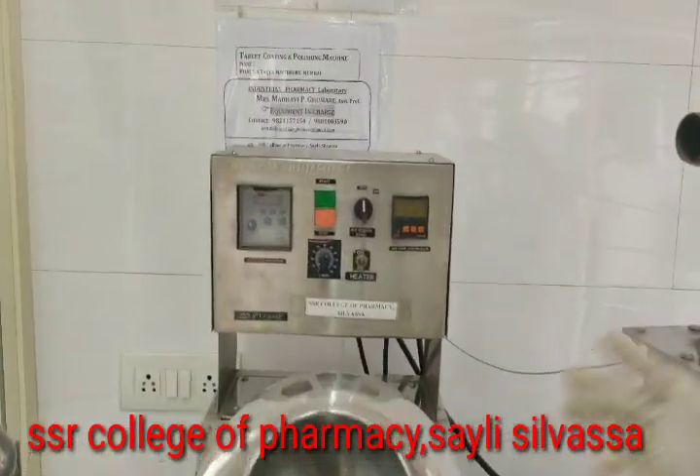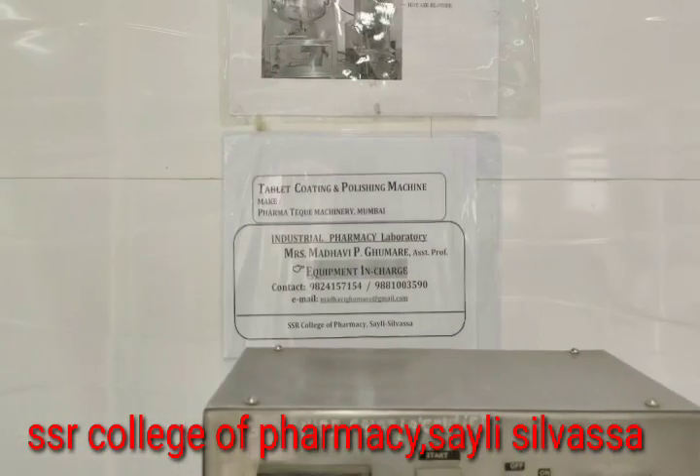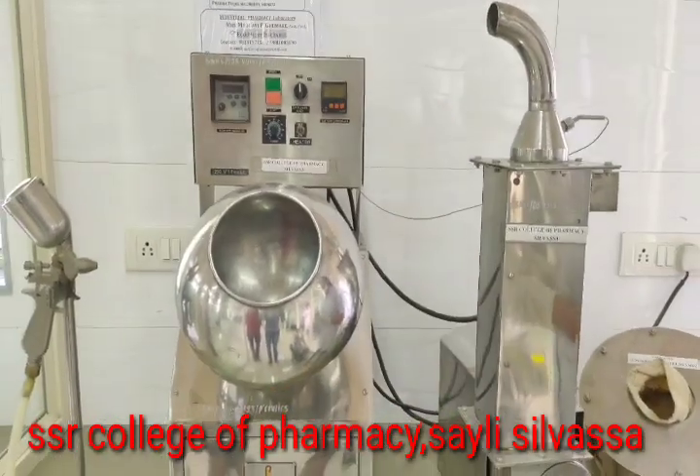This is equipment from Pharma Tech Machinery, Mumbai. This equipment has two modes: one is tablet coating and another is polishing.